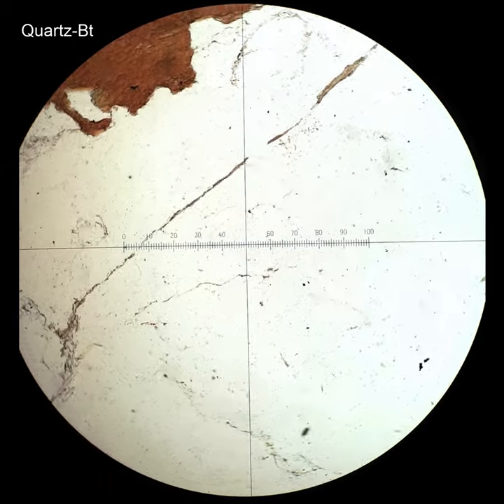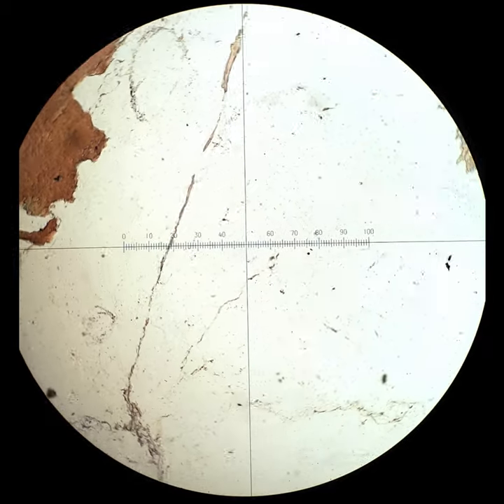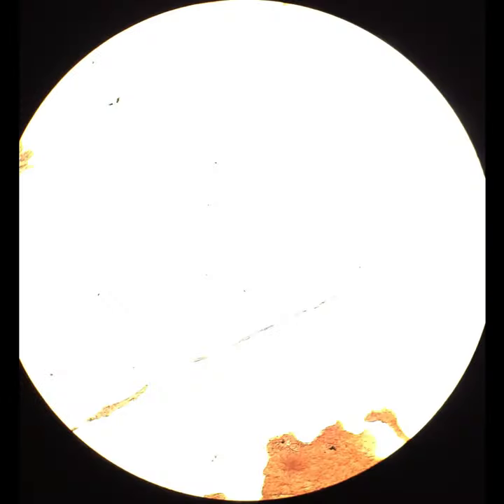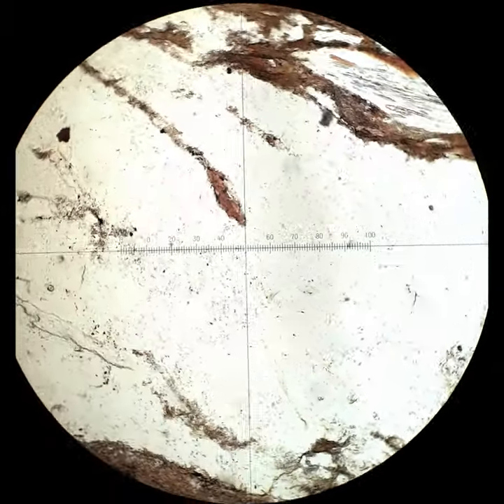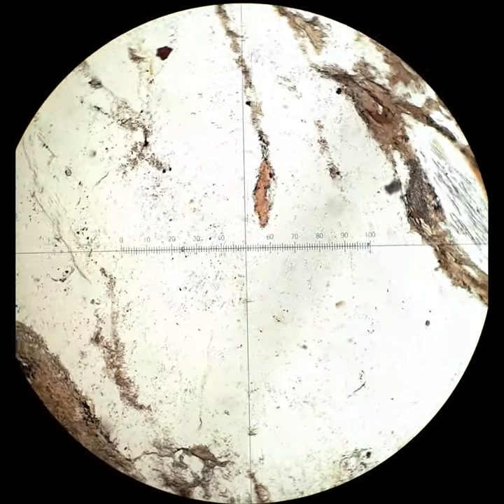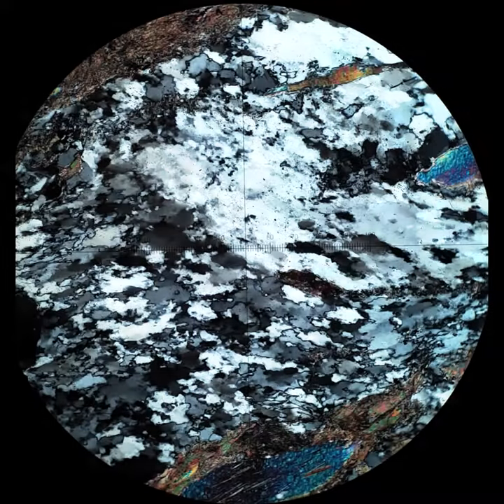This quartz is more deformed — you can't tell that in plain polarized light. But when the polars are crossed, you'll be able to see there are lots and lots of different sub-grain boundaries. Even those larger grains with the serrated edges have also started to break up into little sub-grains. And then a still more deformed example of quartz — again, you really don't see much in plain polarized light, but as you cross the polars, you'll see that it is broken up into numerous tiny grains, similar to the one before, just more intense.